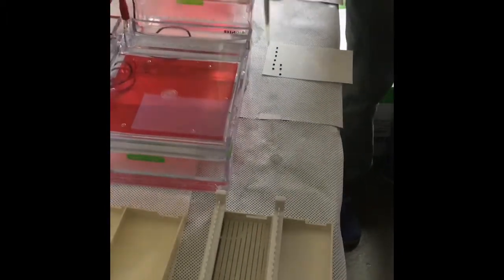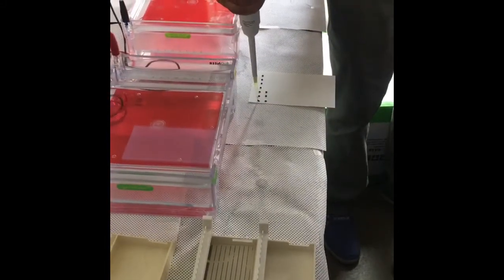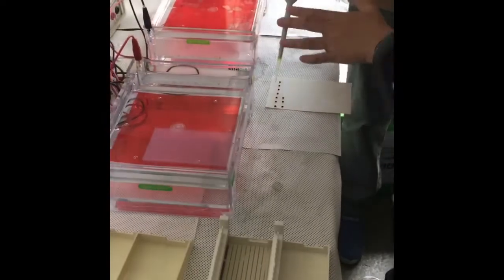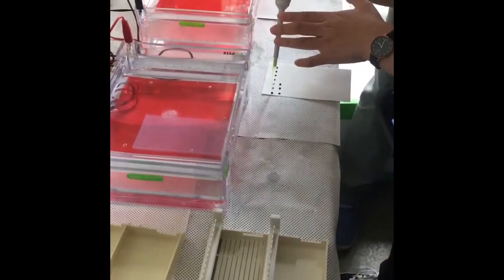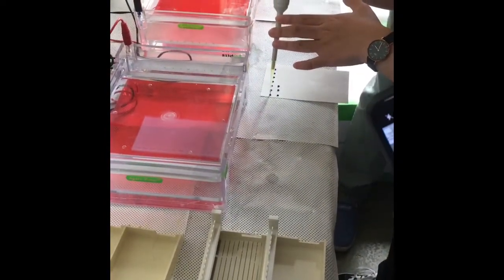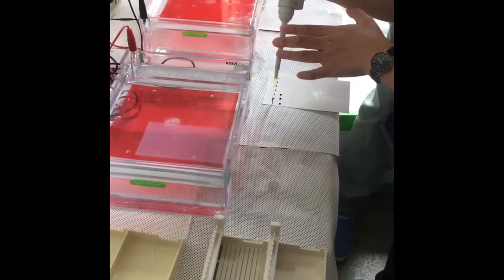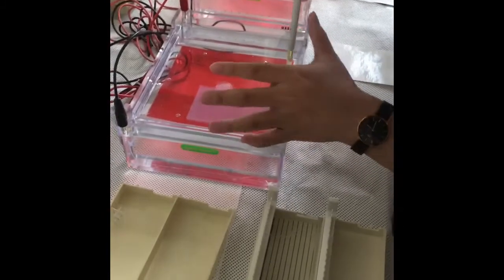Who's first? Okay, I will put here. Stephanie put 3. There must not be any bubble. Close.